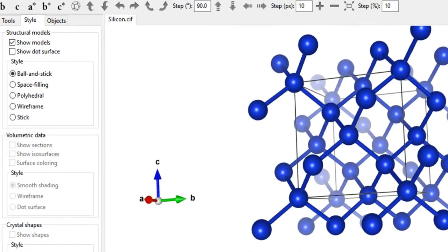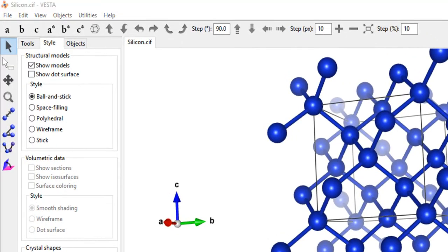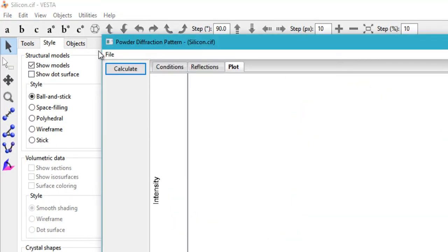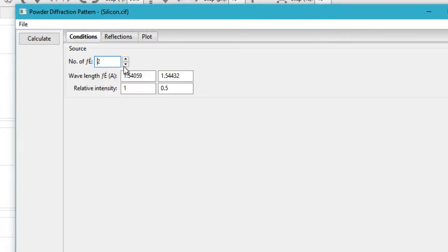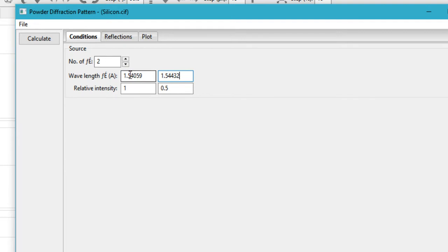Coming back to our Vesta program, you go to Utilities, go to Powder Diffraction Pattern, and then click on Conditions. Here currently it has two radiations of these two different wavelengths and these relative intensities.